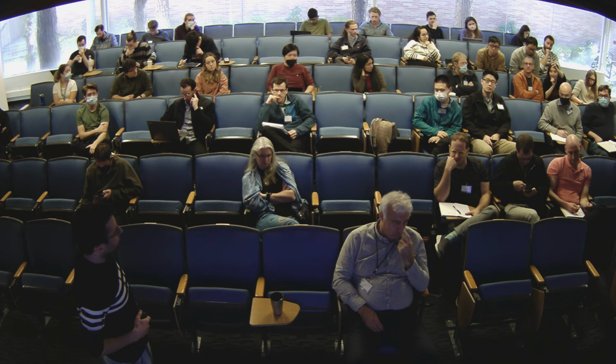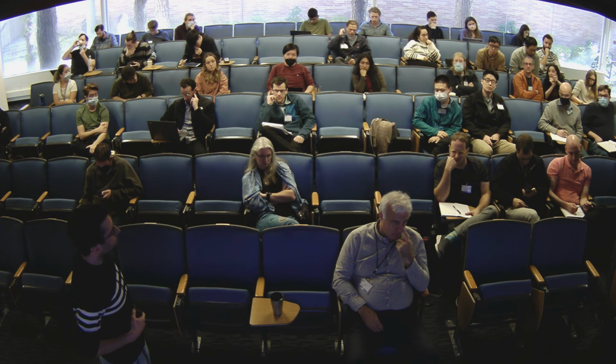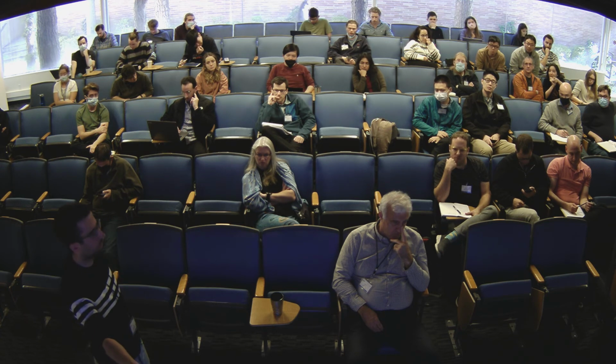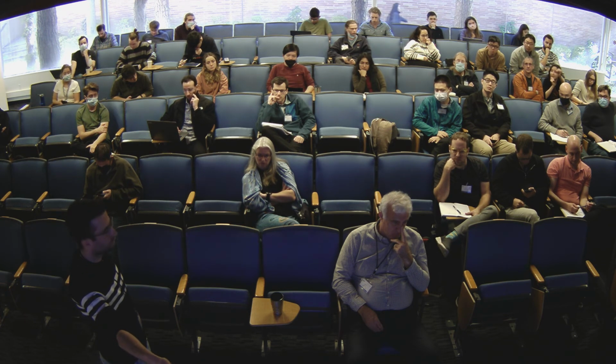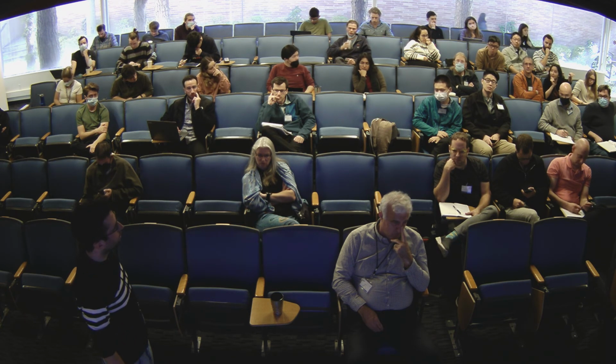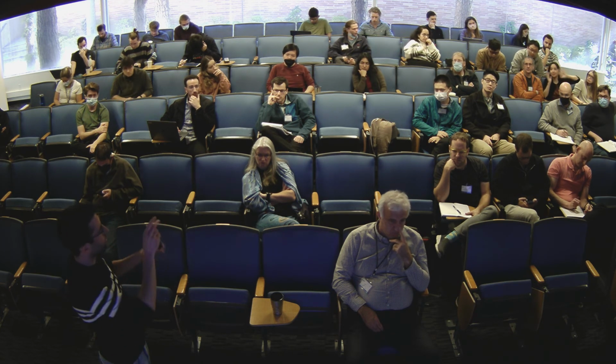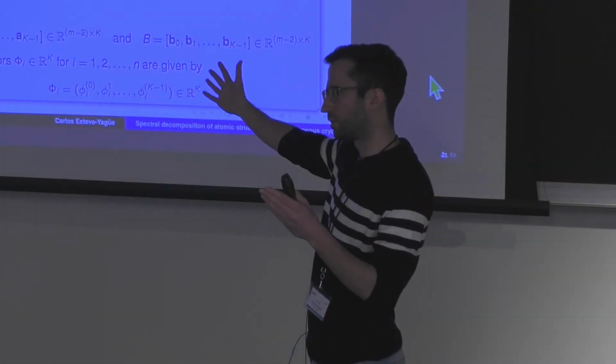So when you're doing your minimization, you already assume you know your phi. Yeah, you know phi. You know your phi for each particle, so you know where it belongs in this manifold. Yeah, we know where it is in the latent space, let's say. So you want to construct, roughly speaking, a map from the latent space to the structure.